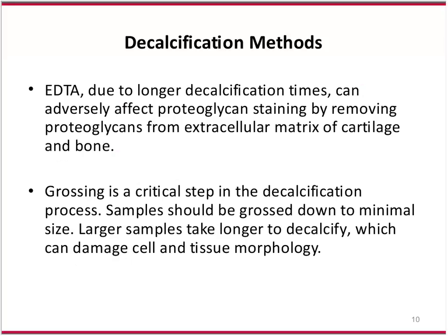EDTA, although it takes longer, you have to pay very, very close attention to it because of it taking longer. It can have a bad effect on the proteoglycan staining by removing the proteoglycans from the extracellular matrix of cartilage and bone. Now, if you're doing a stain and you want to quantify that, if you've over-decalcified your sample and affected the proteoglycans, well, how will you measure that if the samples are going to vary?